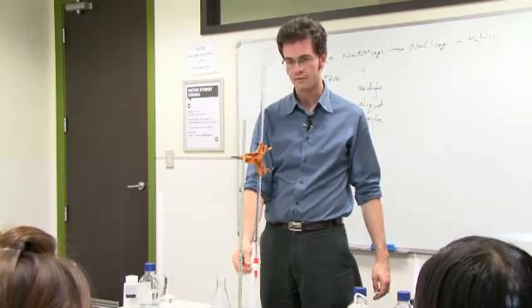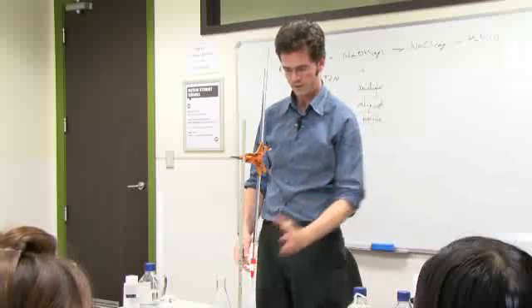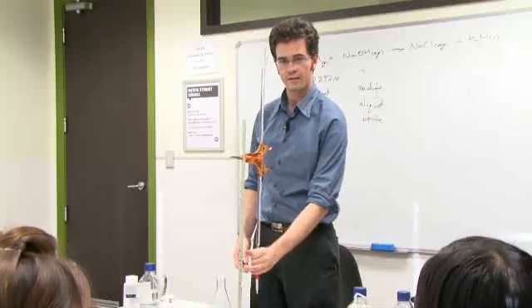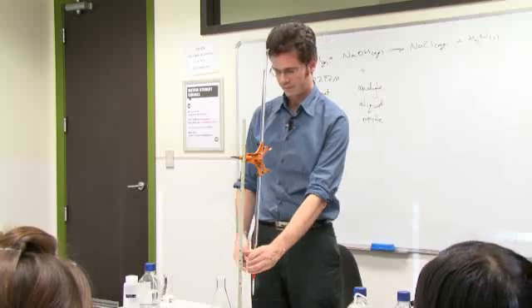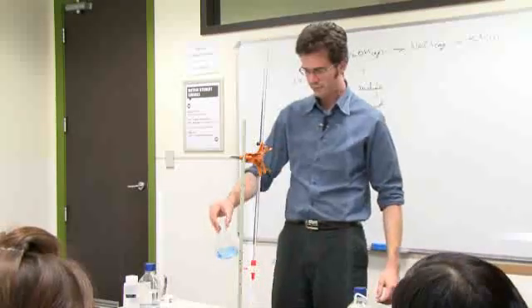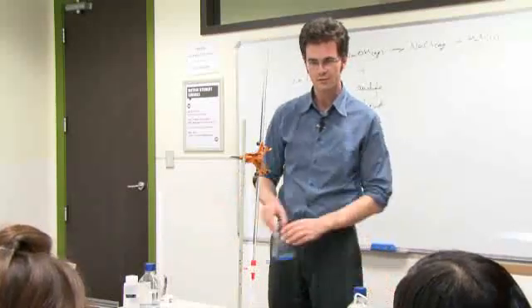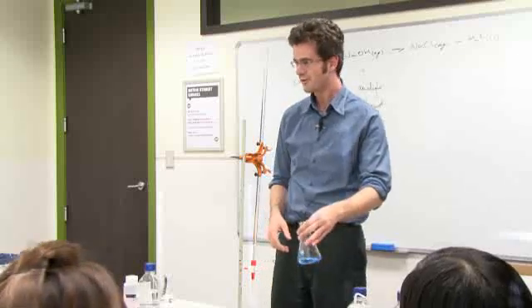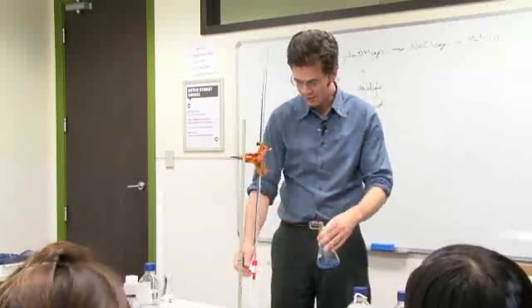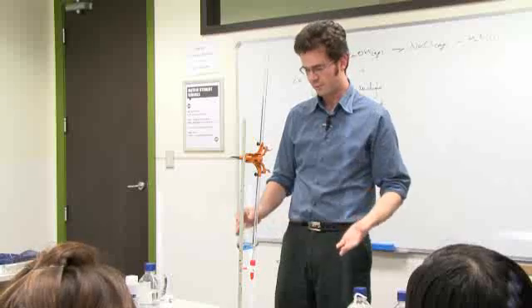Instead of using your right hand and threatening it, left hand, surround it. That way it can't break. The other reason is that have you ever tried swirling your flask with your hand that you don't use? I'm right-handed. You try swirling with your left hand, you feel really uncoordinated. So you're uncoordinated and you're trying to break your glass. Swap your hands around.